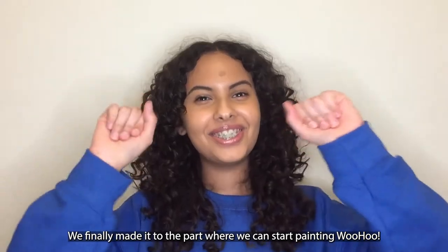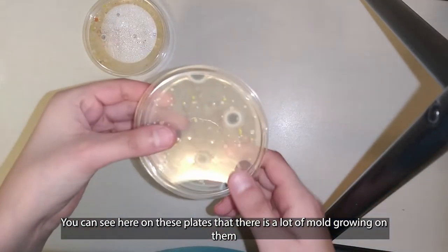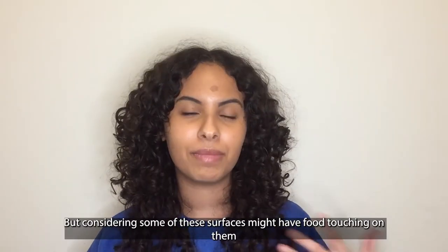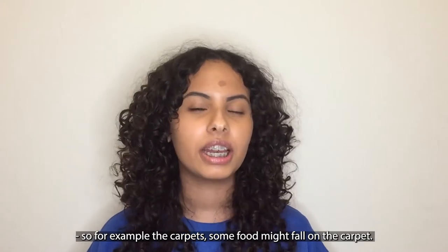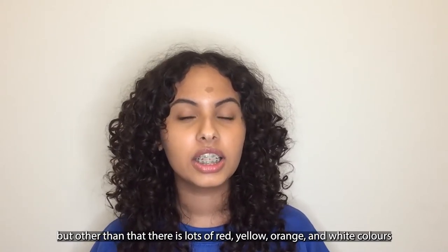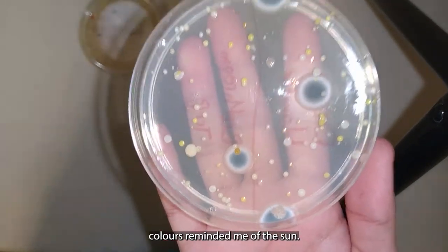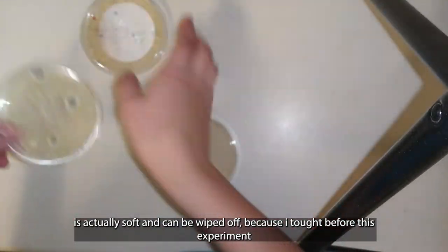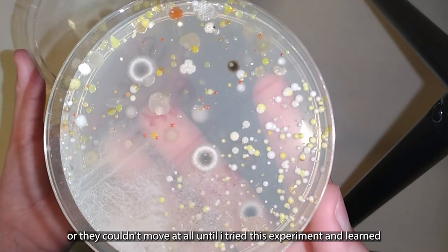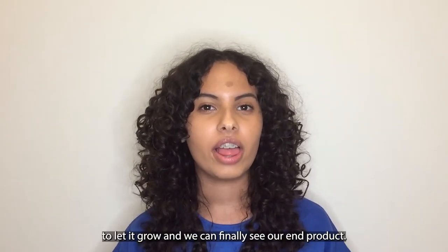We finally made it to the part where we can start painting! The bacteria has now grown and we could start. You can see here on these plates that there's a lot of mold growing on them, which is surprising — meaning I might have mold on my surfaces. Considering that some surfaces might have food touching them, like the carpet where food might fall, mold is bound to grow. But other than that, there's also a lot of red, yellow, orange, and white colors that we can work with to make some art. As you can see, I'm swabbing those colors to create a sun, because those colors reminded me of the sun. I was surprised to learn that the bacteria grown on the plate is actually soft and can be wiped off — I thought those colors were solid before trying this experiment. After painting with the bacteria, we'll put it in the fridge once more to let it grow and then we can finally see our end product.